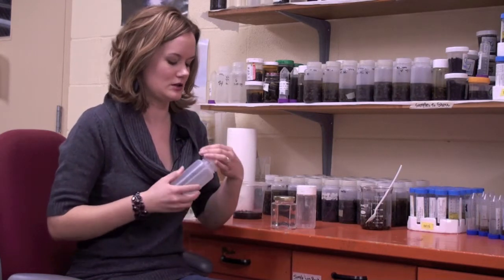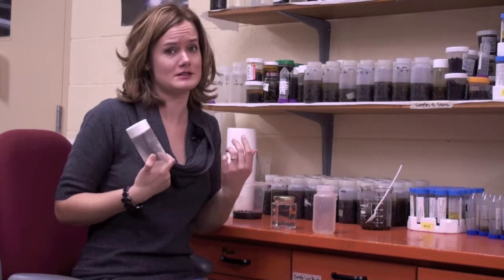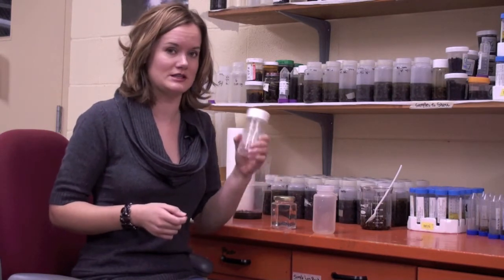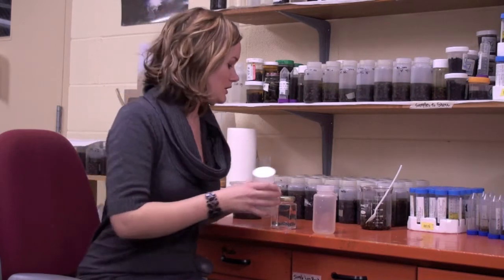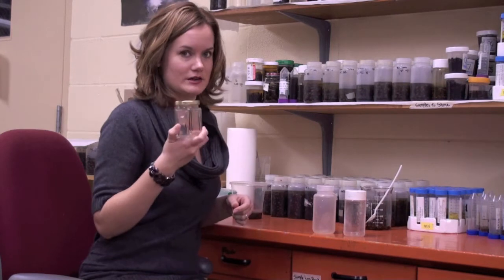Okay, next we're going to talk about the most efficient way to send samples to me. So I have 3 examples here of great bottles or honey jars that you can send me your bees in. So this is just a simple Nalgene bottle, and that's always good. And this is actually a makeup container, and this is fine too, as long as you can send me whatever you have in your house, as long as the bees can fit into it, and it's easy for me to get into, and it's airtight. And like I said, you can use a honey jar as well because it's airtight.